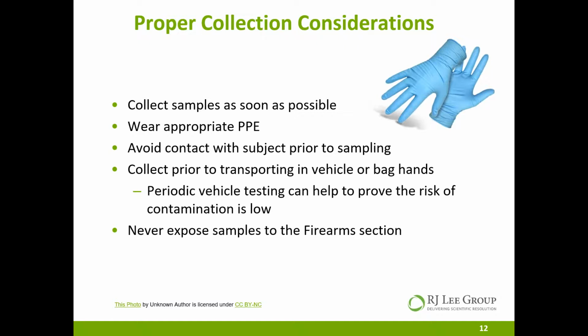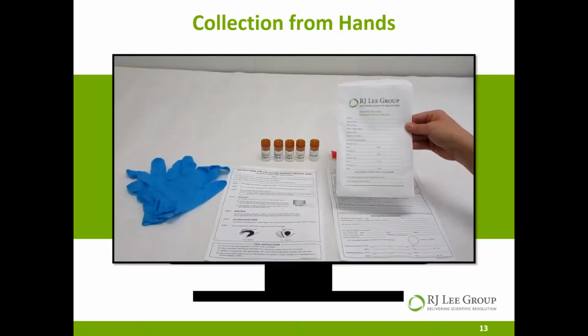And finally, I hope this goes without saying, but you should never expose your gunshot residue samples to the firearms section of your agency or laboratory. Obviously, that would not be very good.